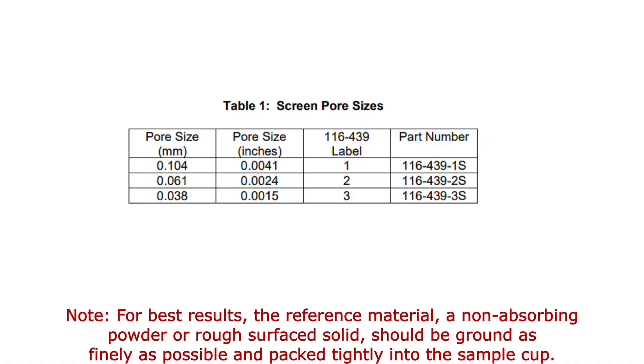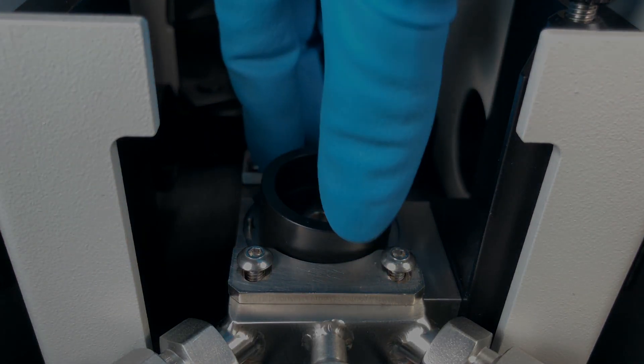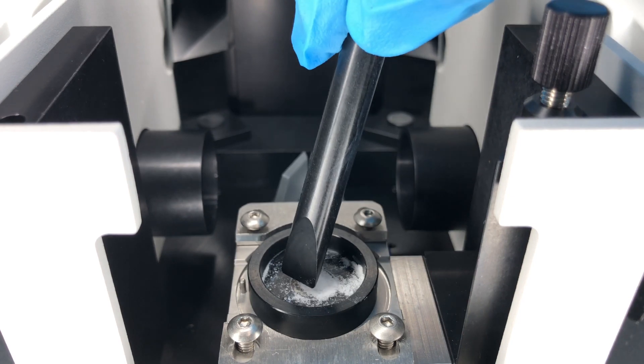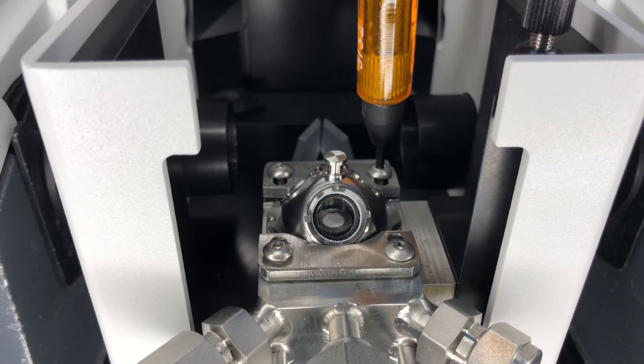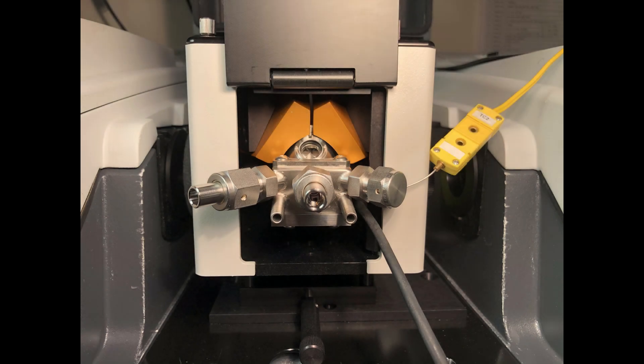Before putting the sample or background material into the sample cup, a screen or filter must be installed. Select the screen with a smaller pore size than the sample particle size, as shown in the table in the manual. Place a sample screen or ceramic filter into the sample cup and place the plastic overflow tray over the sample cup. Fill the sample cup with the reference material and use the packing tool to level off the surface. Carefully remove the overflow tray and install the dome on the HVC.